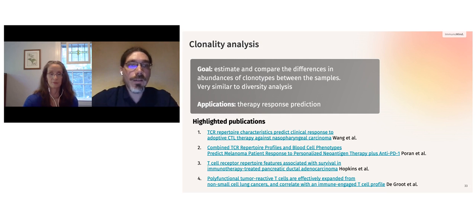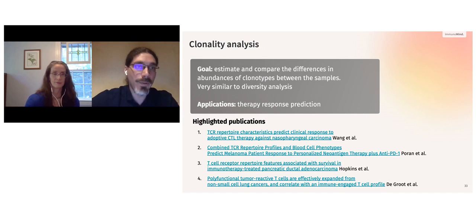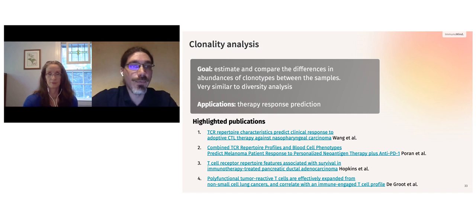The current version, repSample with downsample, is the simplest one, and it works great. It doesn't use any probabilities. It just randomly takes, like in a statistical exercise, spheres of different colors from a bag with these spheres.